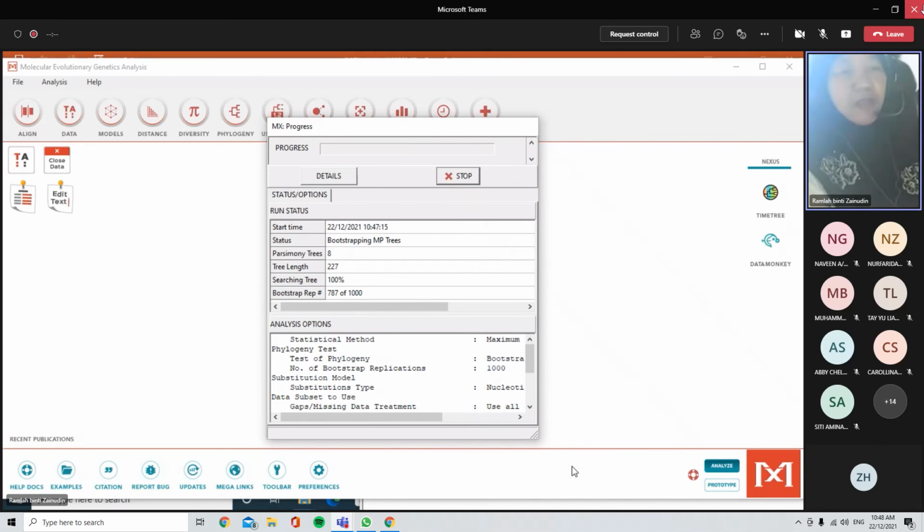Parsimony and also Bayesian because they the probability, so they give you many trees that have the shortest length atau dia bagi the most parsimonious tree. Then you have to do the consensus. Tapi kalau the neighbor joining distance method, like the likelihood also distance, they will give you only one tree. So you have a maximum likelihood tree. Tidak ada consensus di situ.